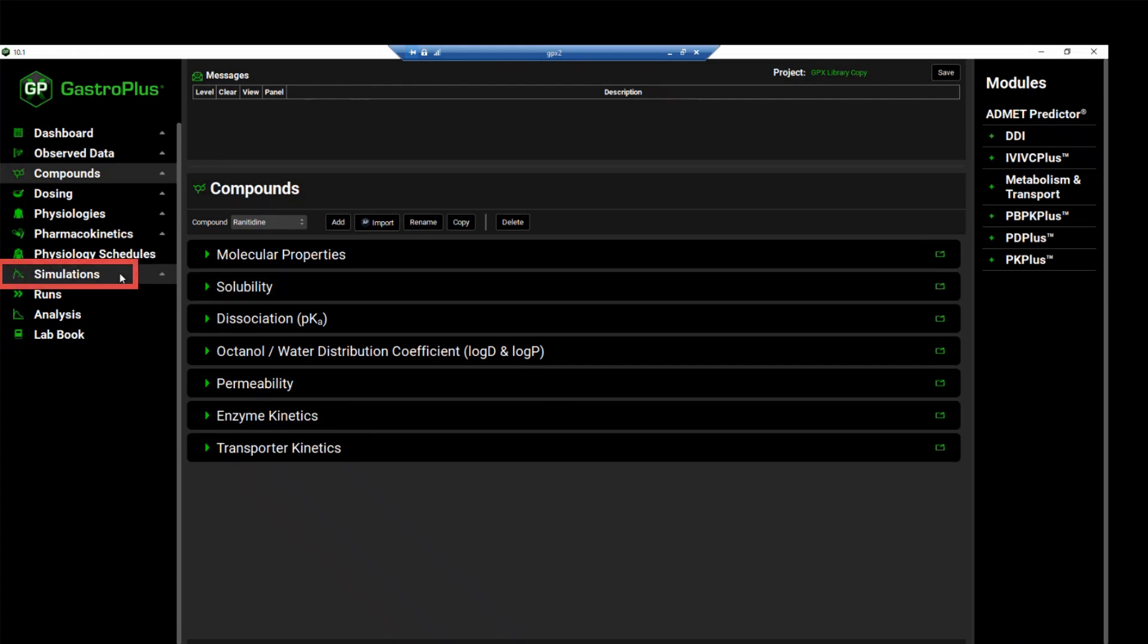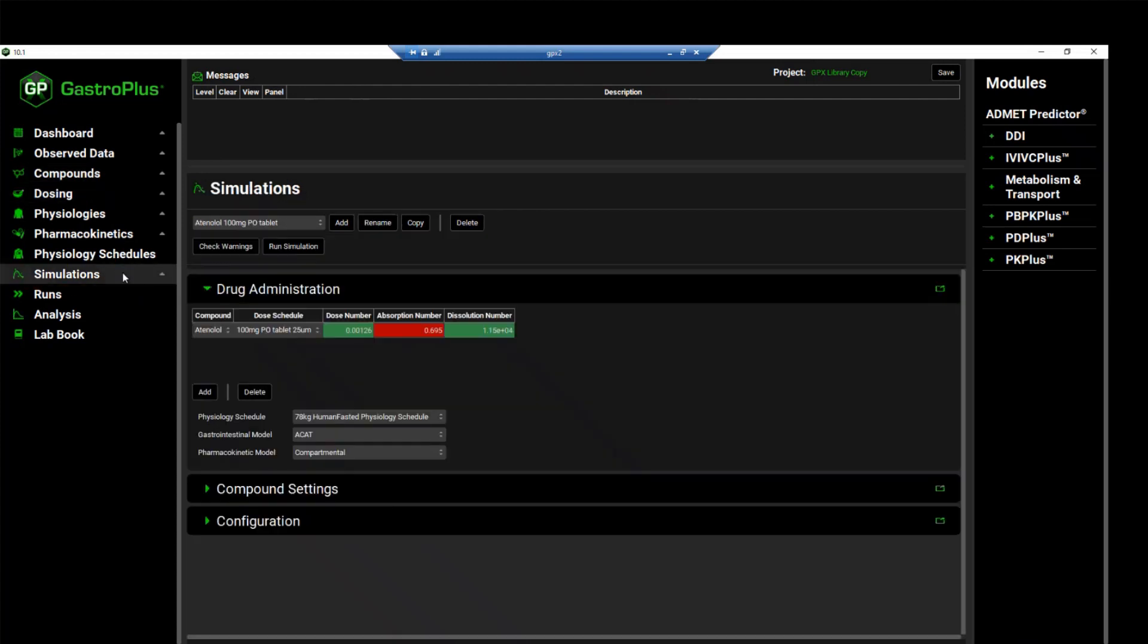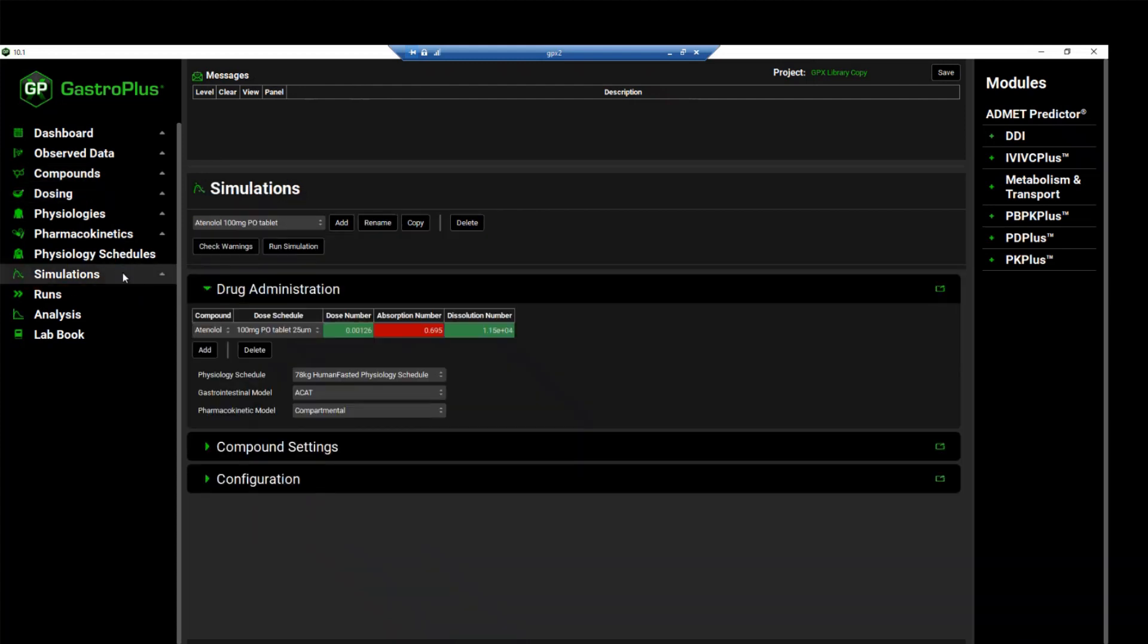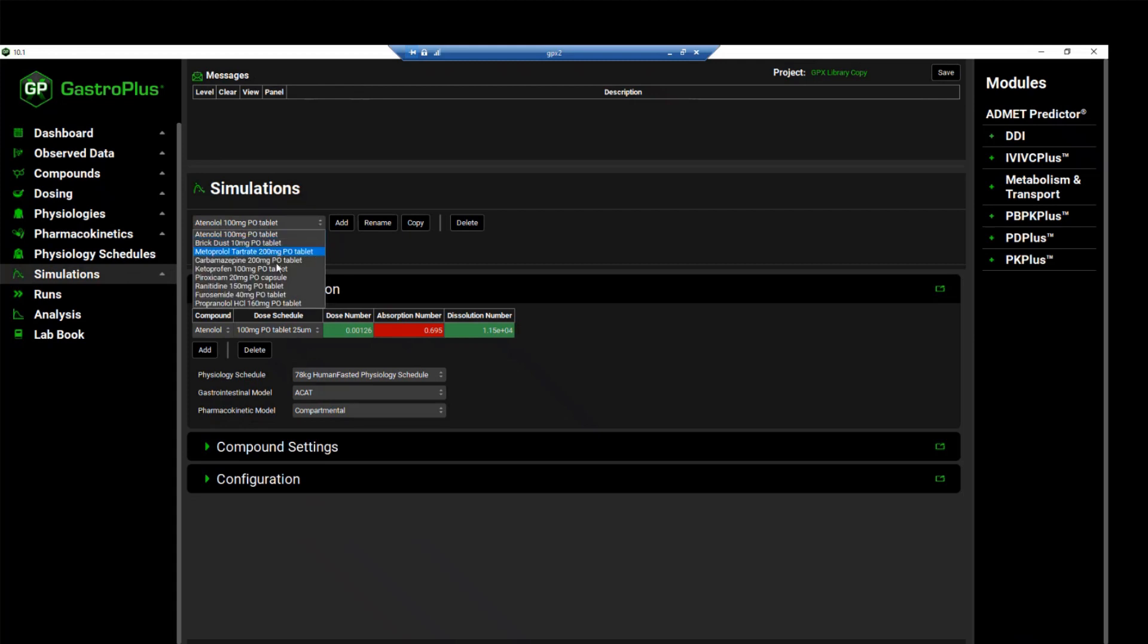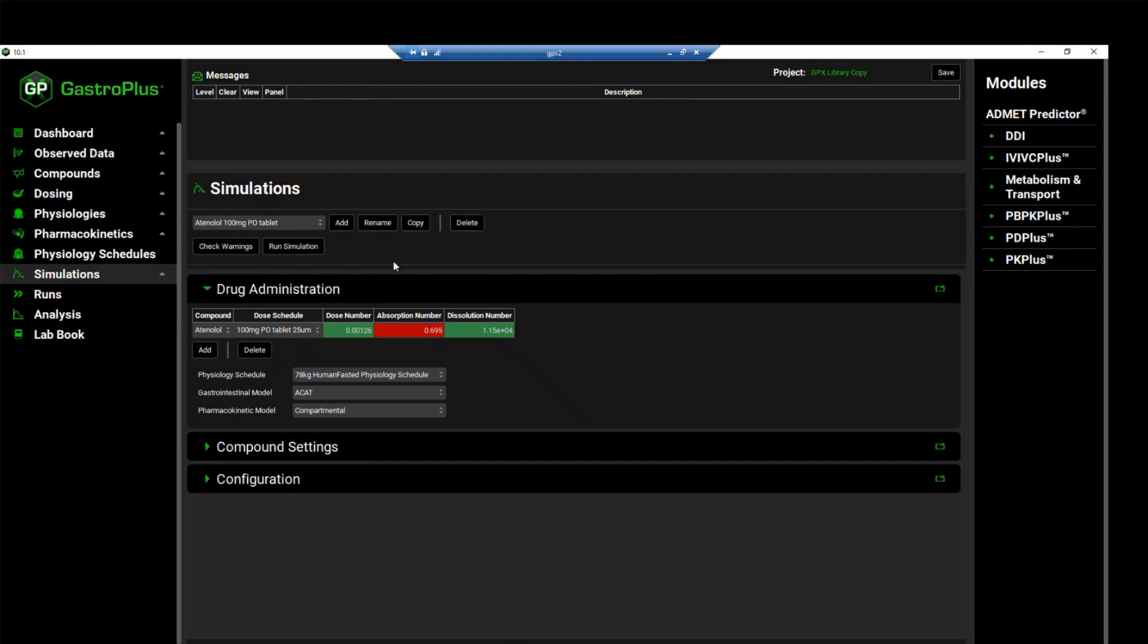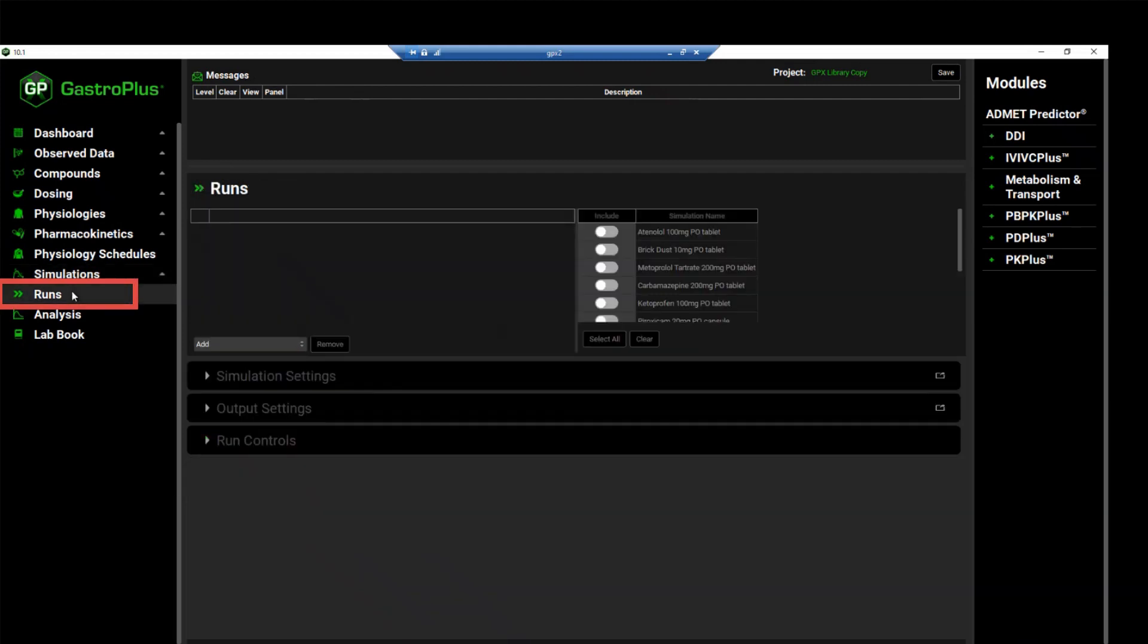We'll skip over to the simulations view. And from the simulations dropdown, we can see that there are nine different simulations created in this project. Instead of running each simulation individually, we will run a batch simulation using the run mode in GPX. For this, navigate to the runs view and click to add a simulation.